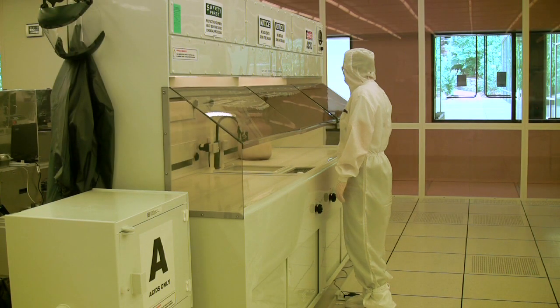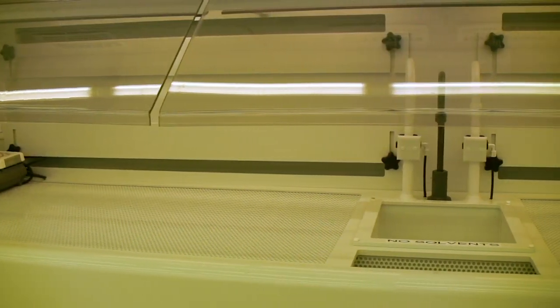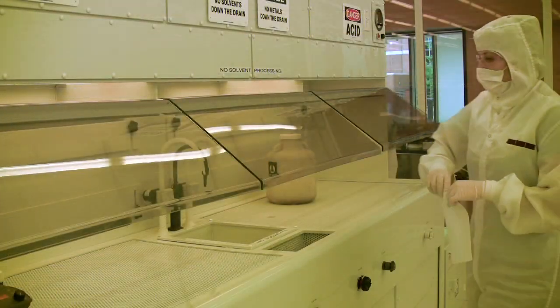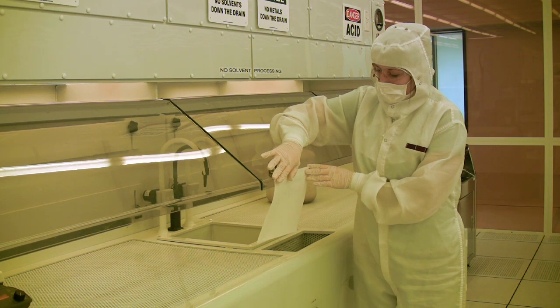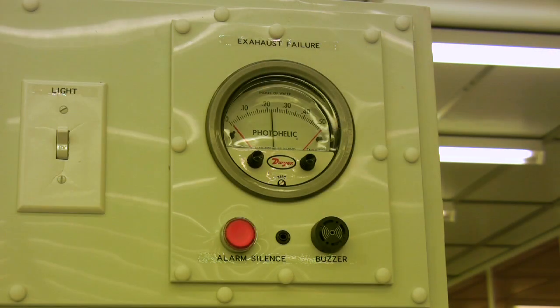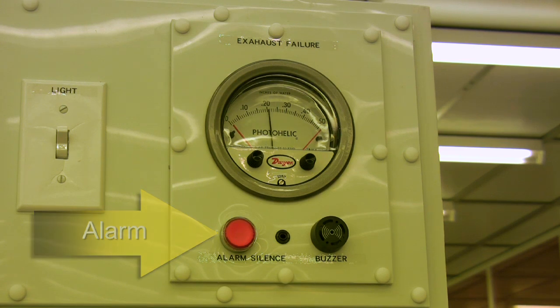Prior to using the fume hood, you should inspect it to see if it is working properly. You should also make sure that the work area inside the hood is free of obstructions or spilled chemicals. You can test the air flow moving into the fume hood by holding a tech wipe in the open area between the sash and the wet bench — you should notice it being pulled slightly inward. Each fume hood is equipped with an alarm that will sound if there is an improper amount of air flow, which could result from a malfunctioning hood or having too many obstructions inside the hood.